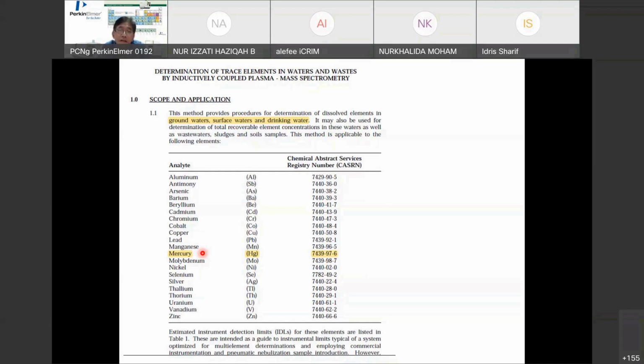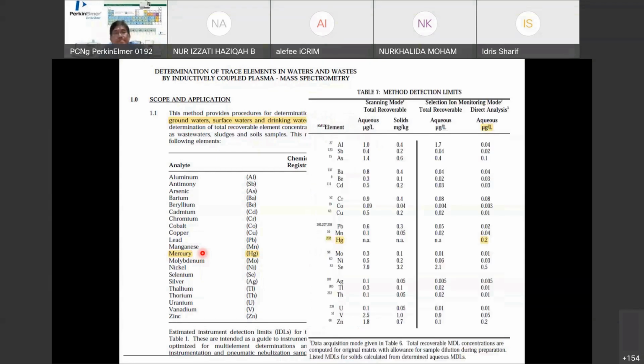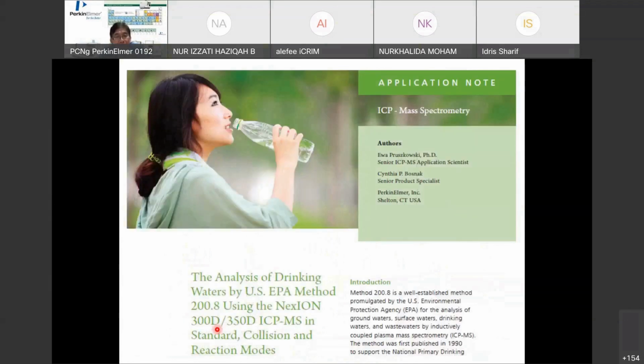Let's say for the cold case or whatever, ICP-MS is the correct instrument to do water, but ICP-OES cannot really do the full set of elements. Let's say the full set of elements to be validated for drinking water will be on ICP-MS. Certain elements you may do in-house, validating your own ICP-MS, and maybe there are people doing it on ICP-OES. So this one is listed on ICP-MS.